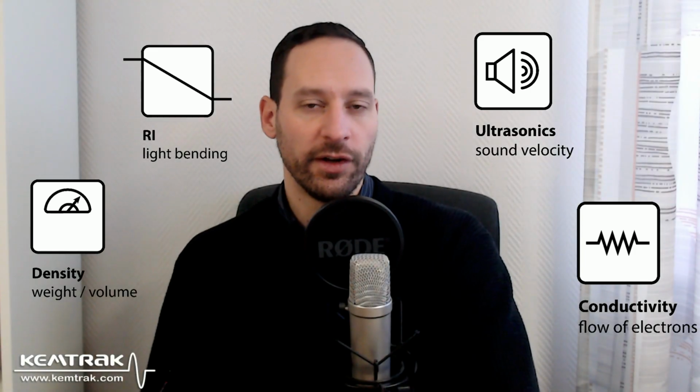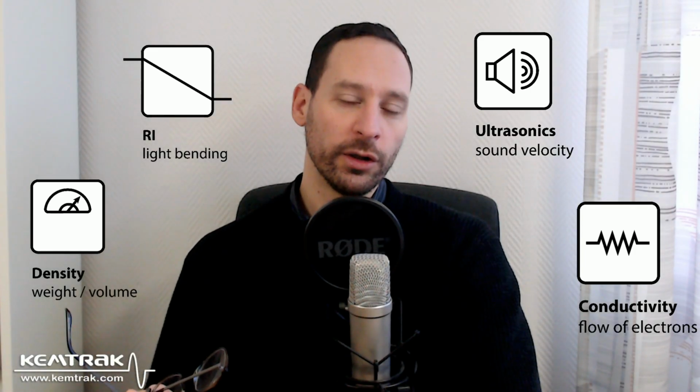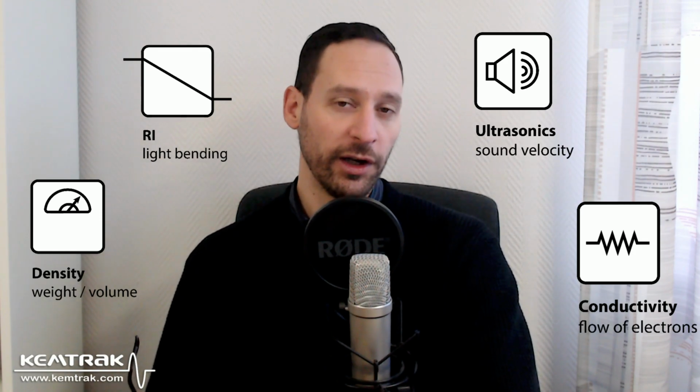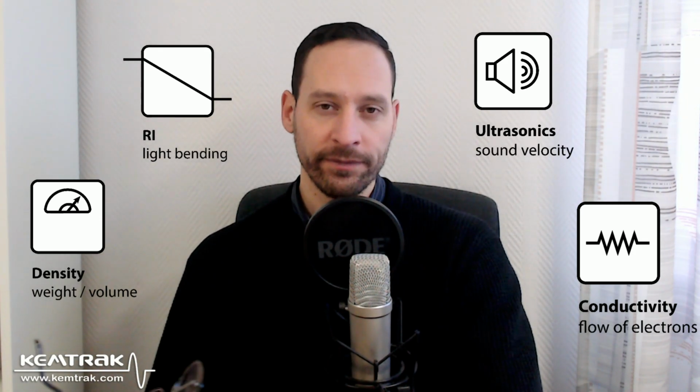The techniques I just talked about measure what are called bulk fluid properties, which arise when atoms, ions, or molecules are acting together. By contrast, photometry measures the interaction of light with matter, which allows us to know much more about a specific compound in a bulk. Photometers rely on the absorption of substances in the UV, visible, and near-infrared range.